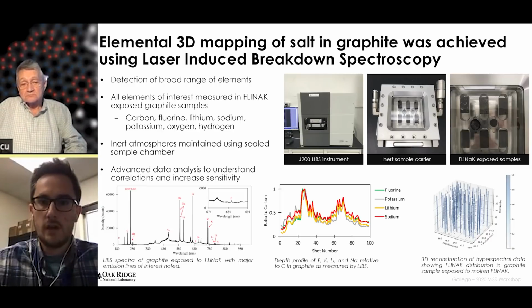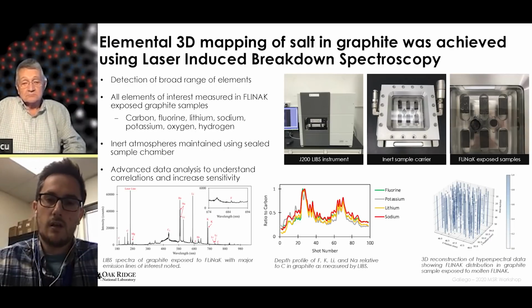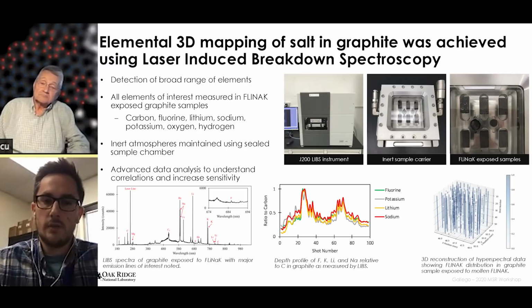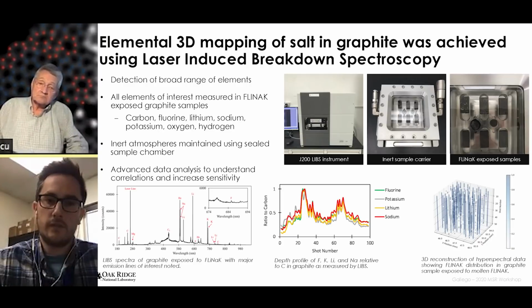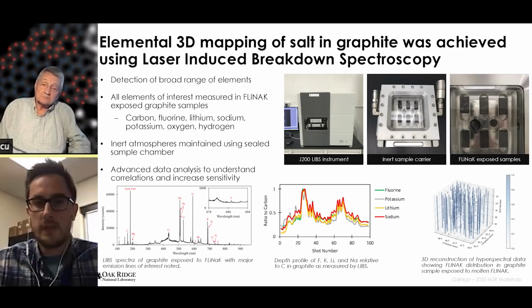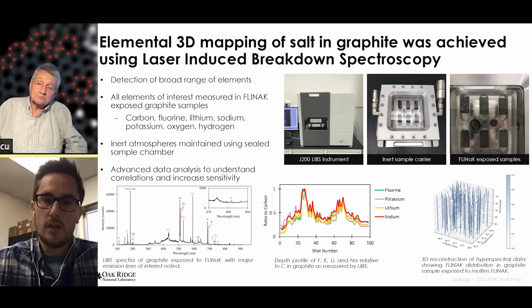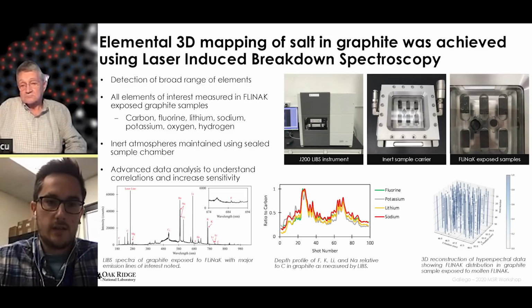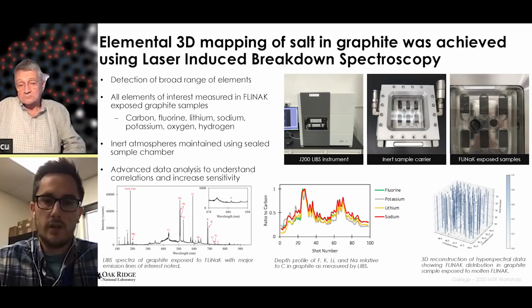So these are, for instance, 6 samples from one of these intrusion measurements that we've then loaded into a sample carrier, which you can see in the top middle image. We've loaded these 6 samples in a glove box with everything kept under inert argon atmosphere, and there's an inlet and outlet where we can change, while maintaining an inert atmosphere, the atmosphere to helium during the LIBS measurements, which allows us to measure the fluorine. We then get, for instance, a 10 by 10 grid of laser shots on the surface and drill down at each one of those spots, however many depths we wish to go.